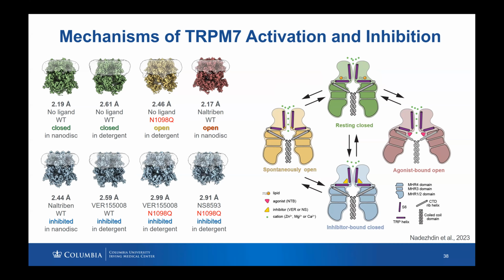Of course, you can try some additional processing, like 3D classification with specific references to separate the open and closed conformations, and maybe you can end up with something.